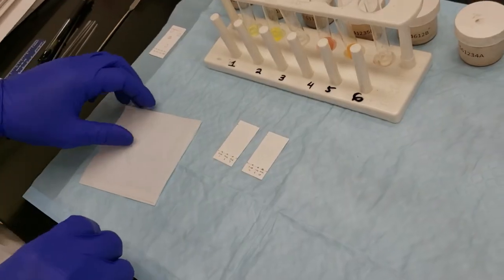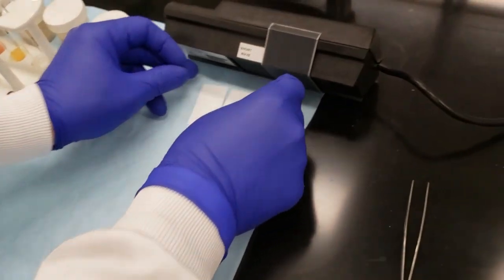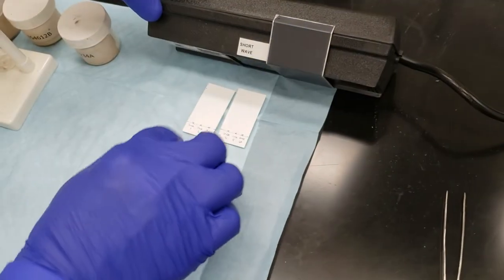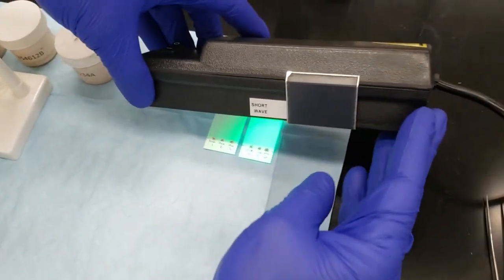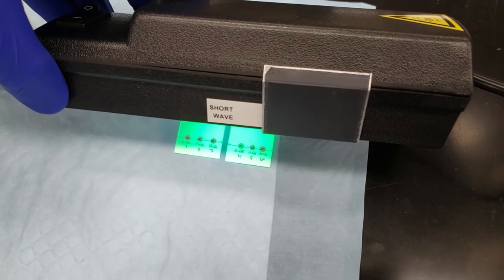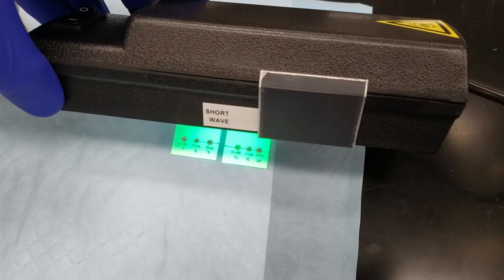All right, so we've got these spotted and ready. Let's check to make sure that they're concentrated enough for us. We're going to use our UV lamp, and we're just looking for a concentrated dark purple or dark black spot on the origin line. And we see that these look very good, so they're ready to be developed. We'll go ahead and refill the solvent chamber and put them in to develop.